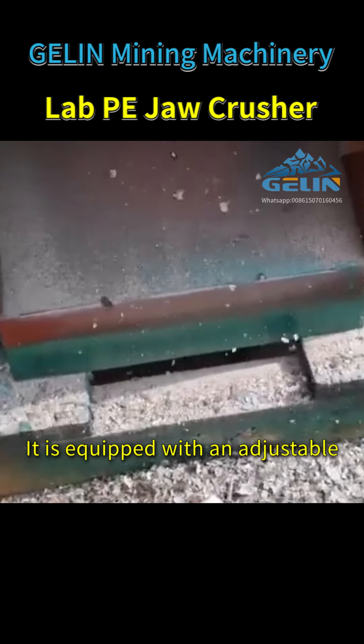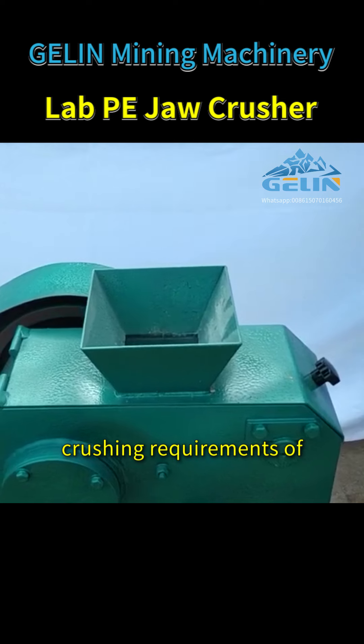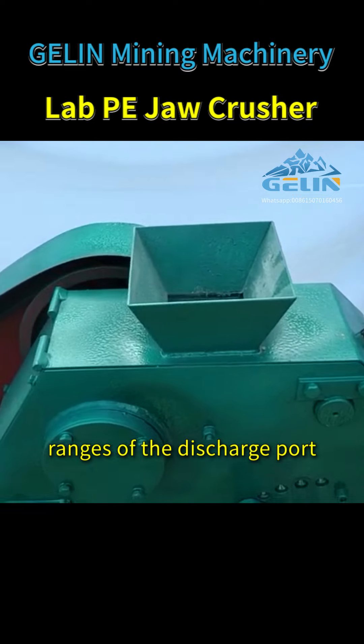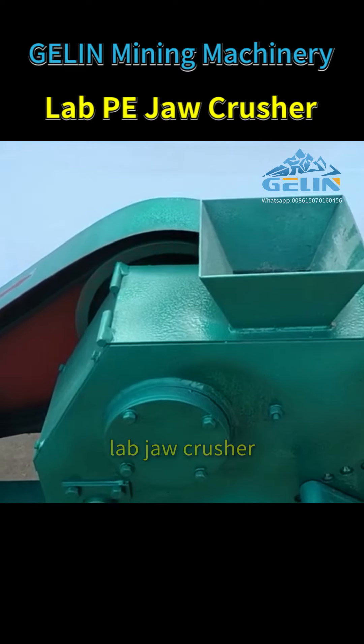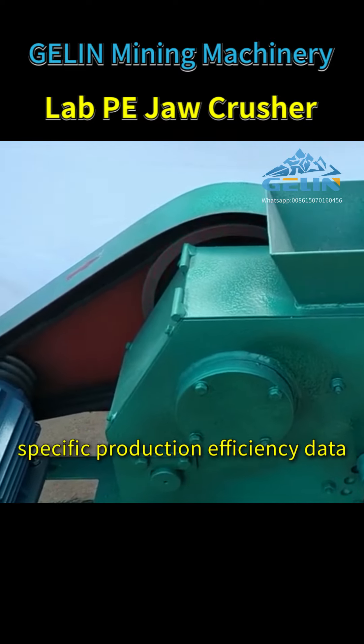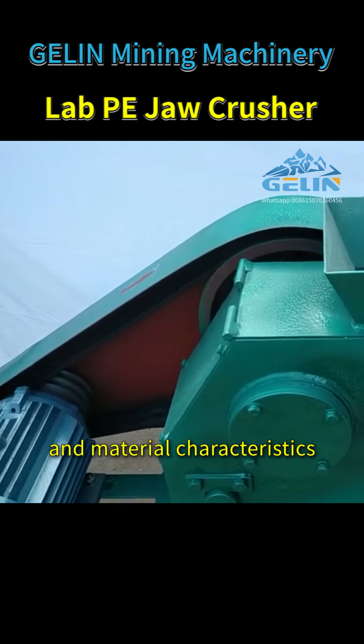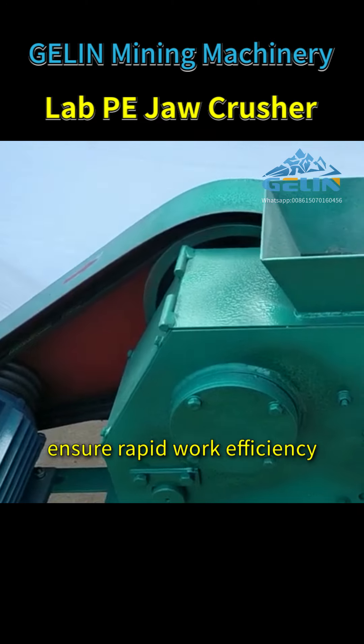It is equipped with an adjustable discharge port to meet the crushing requirements of different particle sizes. Different models have different ranges of the discharge port. When selecting the appropriate lab jaw crusher, specific production efficiency data, application scenarios, and material characteristics should be considered to ensure rapid work efficiency.